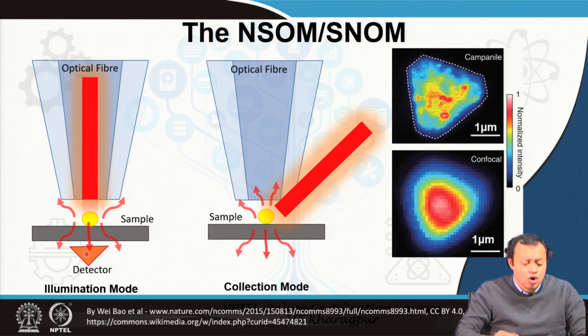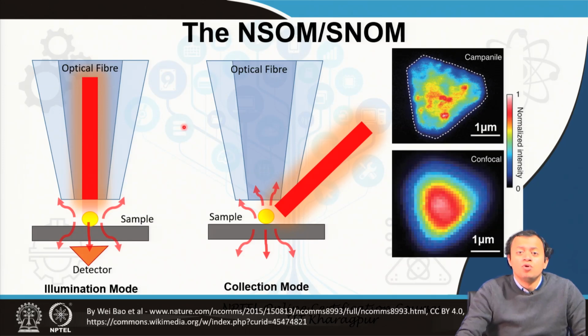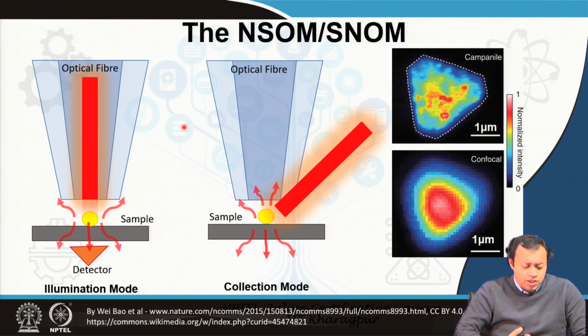Yes, you have to lower the entire temperature, put it in a cryostat or put it in an absolutely vibration free environment, but it is possible. We are doing it regularly. Experimentally we are doing it.